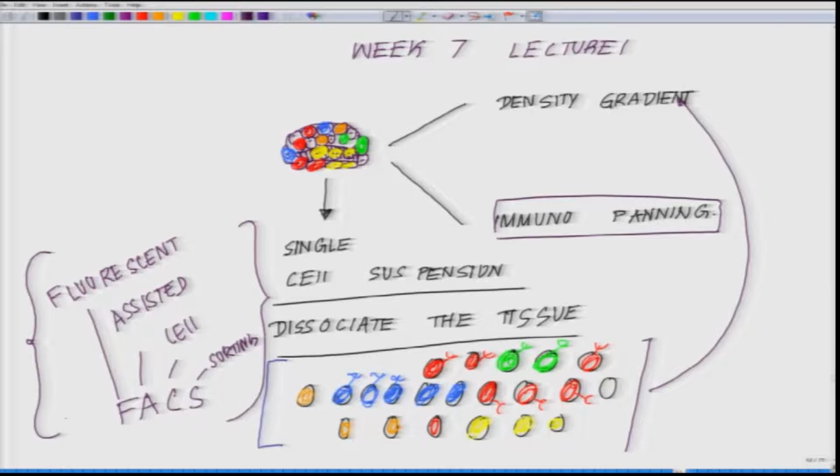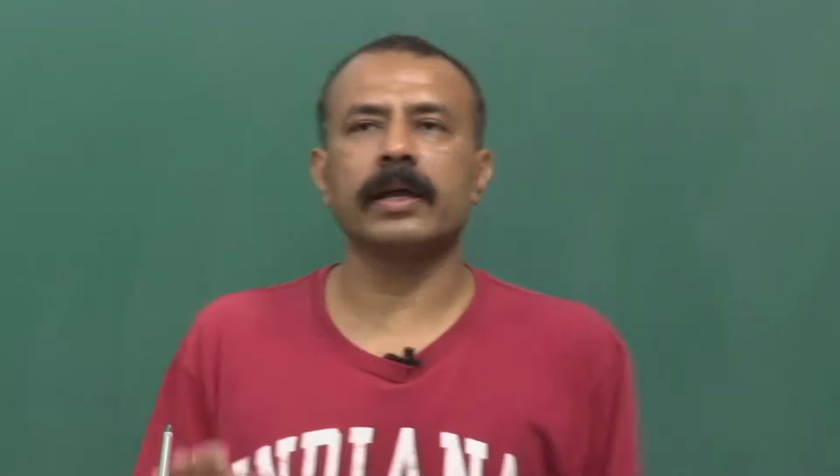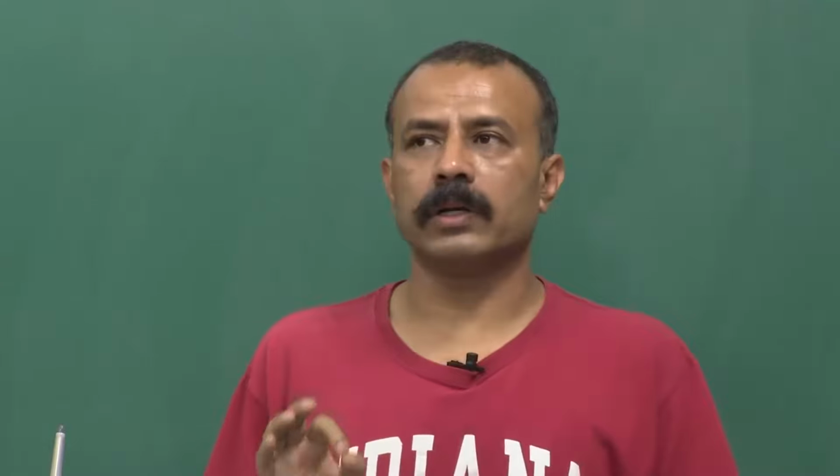So, what really is FACS? We have talked about two techniques, and now I am adding a third one, which is FACS. We will discuss a little bit in this class about what FACS is. Even before getting into any study on FACS, try to understand the basic fundamental logic of what is happening.